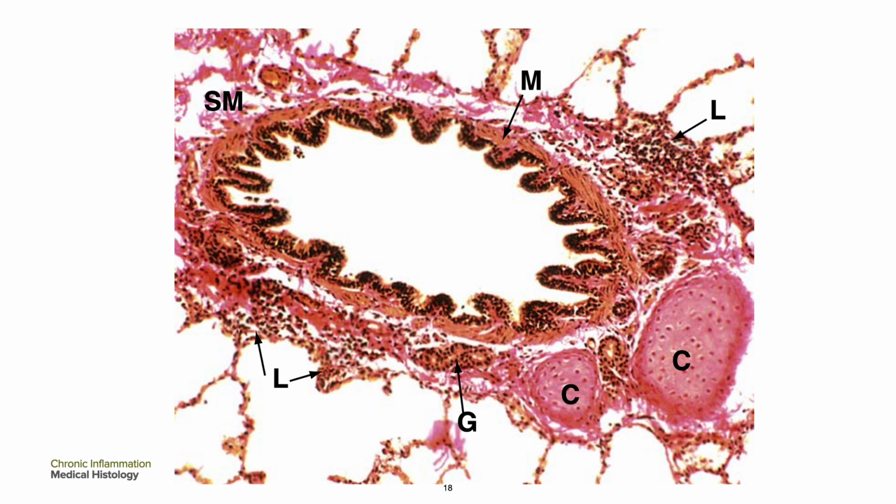The lamina propria is thin, elastic, and completely encircled by smooth muscle, letter M, which is disposed in a spiral manner. This arrangement permits contraction of the bronchi in both length and diameter during expiration. Seromucinous glands, letter G, are sparse in the submucosa. These glands are rarely found within smaller airways. The cartilage framework, letter C, is reduced to a few irregular plates. Cartilage does not usually extend beyond tertiary bronchi.